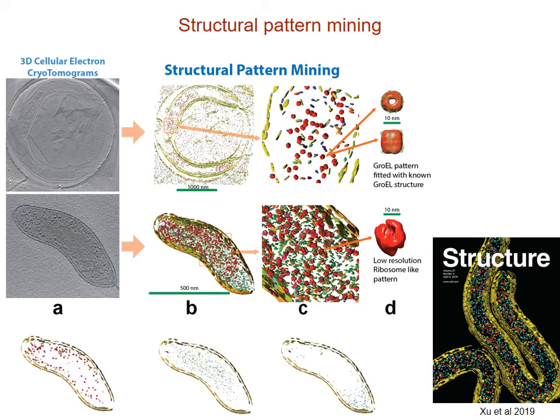This is an example of such structural pattern mining analysis results. These are two slices of two 3D tomograms of two bacterial cells. By applying our structural pattern mining, we are able to detect tons of different structural patterns, among which this pattern we found is very interesting.